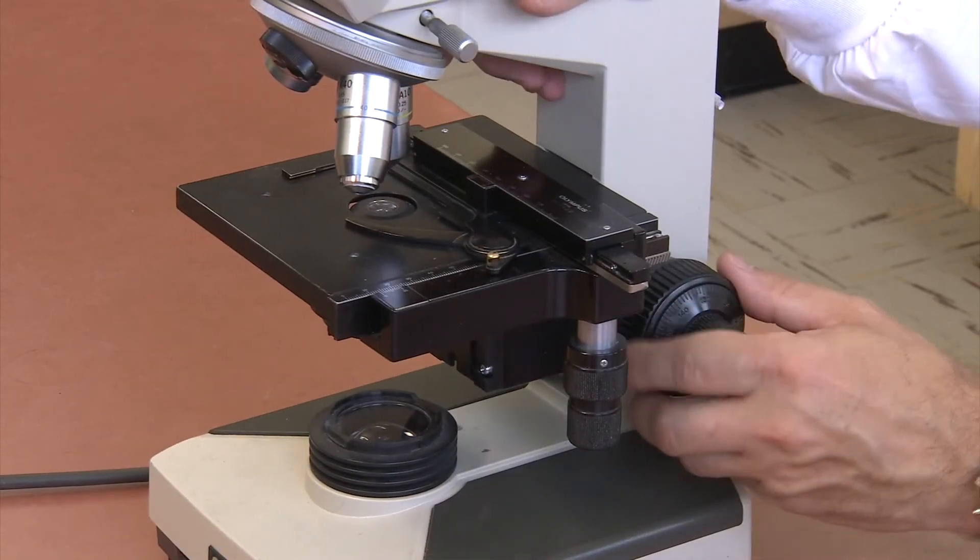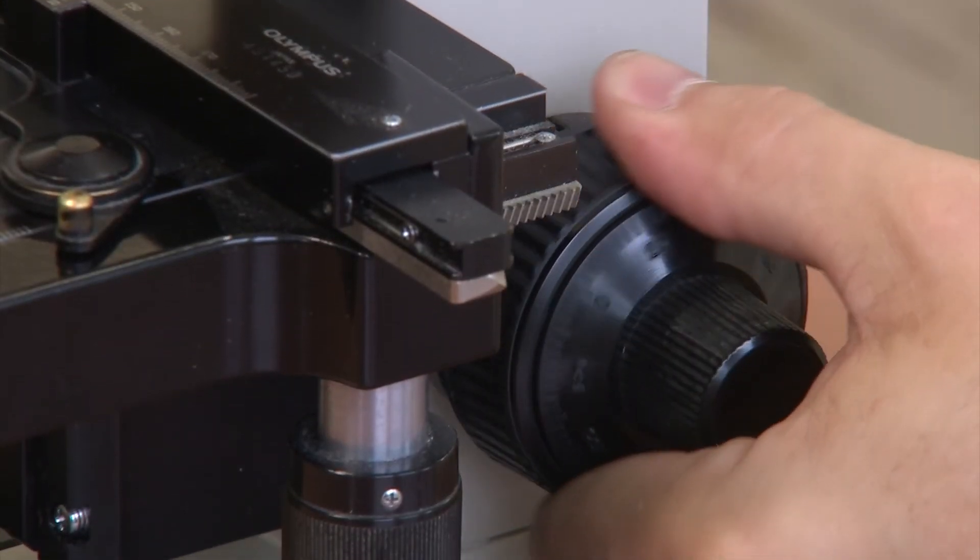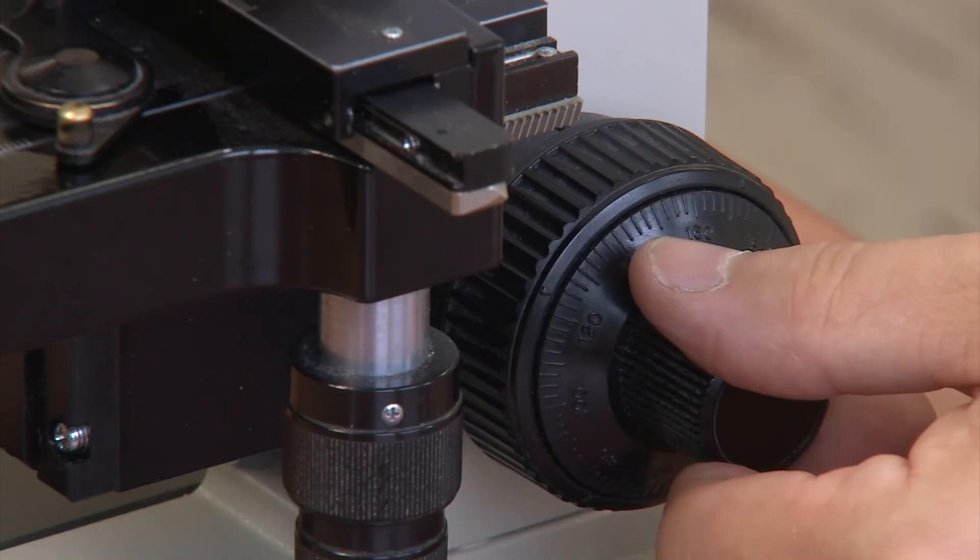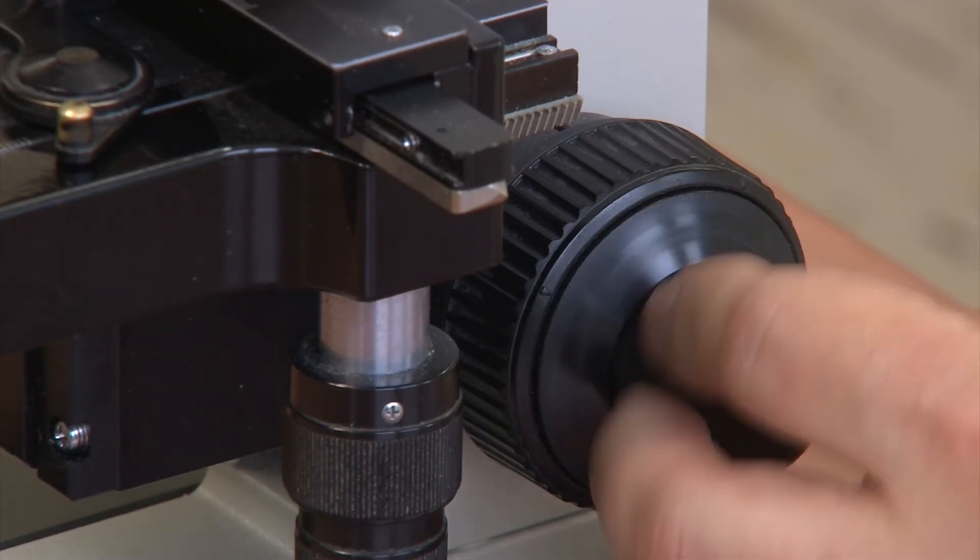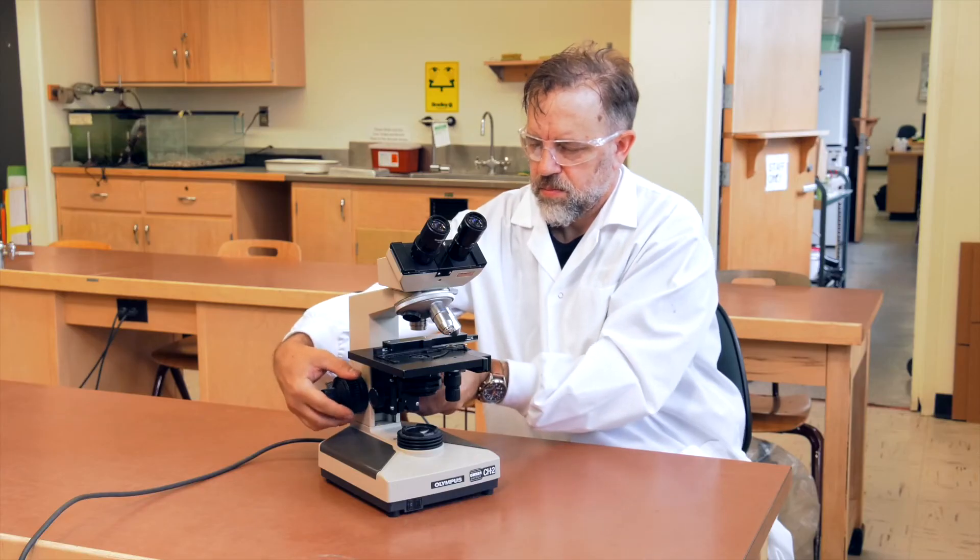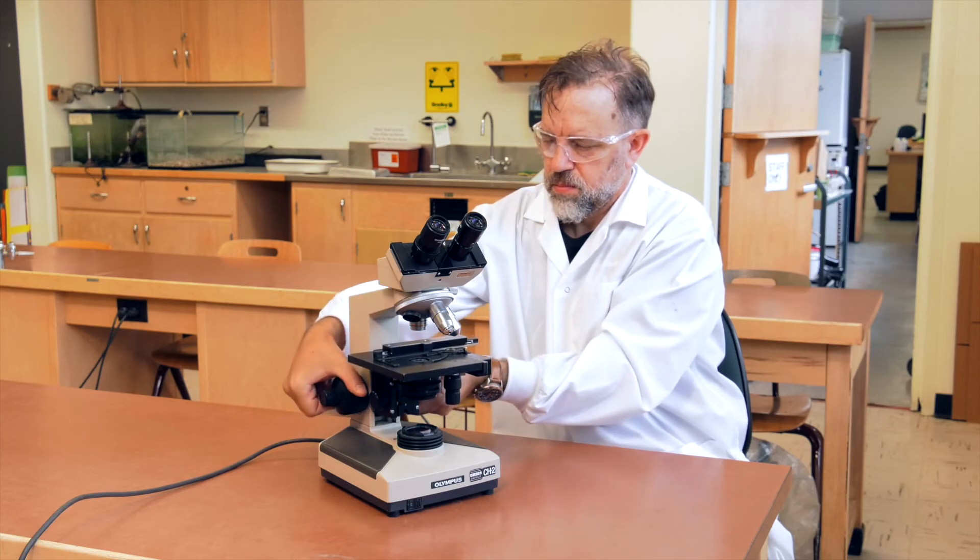At the base of the arm are the coarse and fine focus adjustment knobs. These are on both sides of the arm. The coarse focus is larger and closest to the arm, and the fine focus is smaller and is set in the center of the coarse focus. These knobs adjust the height of your stage, which allows you to focus on your specimen.